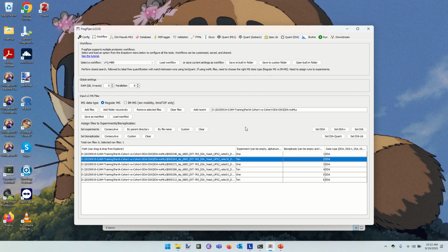So a natural question that you might ask is, is proteomics limited to comparing a cohort to another cohort? And proteomics is capable of doing much more than that. You can certainly have experiments with 3 different factors and cohorts of irregular size and so on. You can do stuff like that. I'm choosing a simple example of comparing 3 runs to 3 runs because this is far and away the most common way that people do differential proteomics.